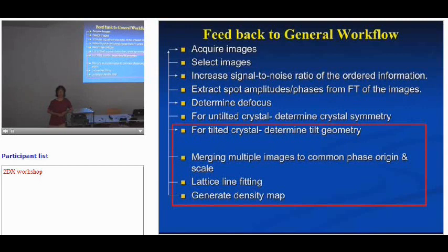And as far as the resolution, let's say one image only goes up to 10 angstrom and the other one has information all the way to 3 angstrom, that is normally taken into account during the merging, where you can specify your resolution limit, and you are going to merge your data into your final set. It treats them equally with weight. Each spot is weighted by its quality.